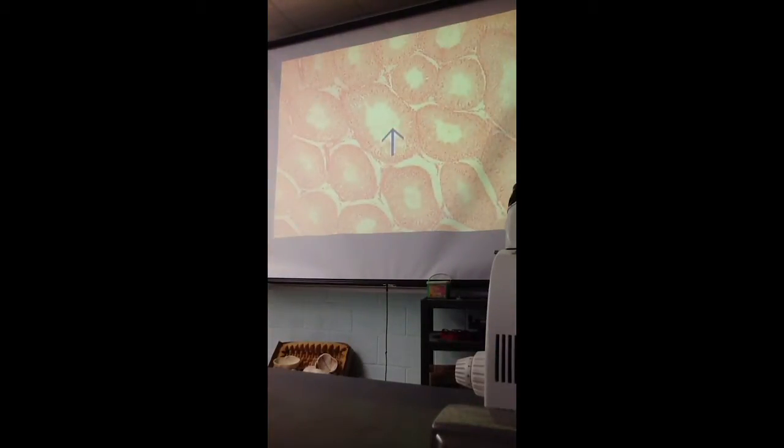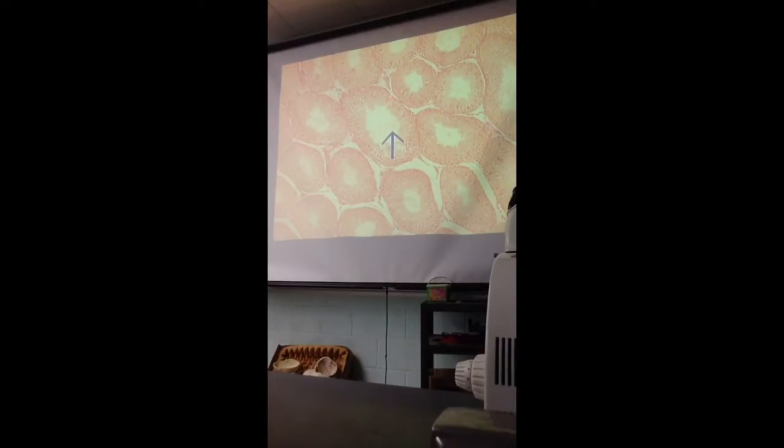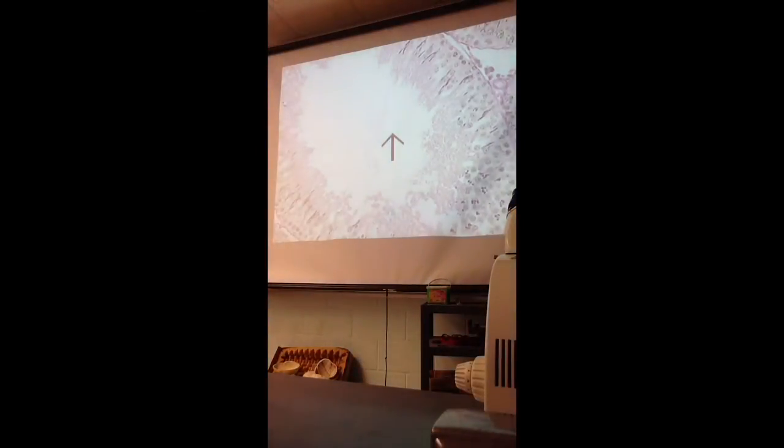What you're looking at is the cross section taken through the seminiferous tubules. If this is the cross section of the testis, you're seeing all the seminiferous tubules that are closely adjoined to one another. So seminiferous tubules are lined with more cuboidal cells, and you know all the other structures that I have shown. Let's look at them in more detail. They're easy to identify.